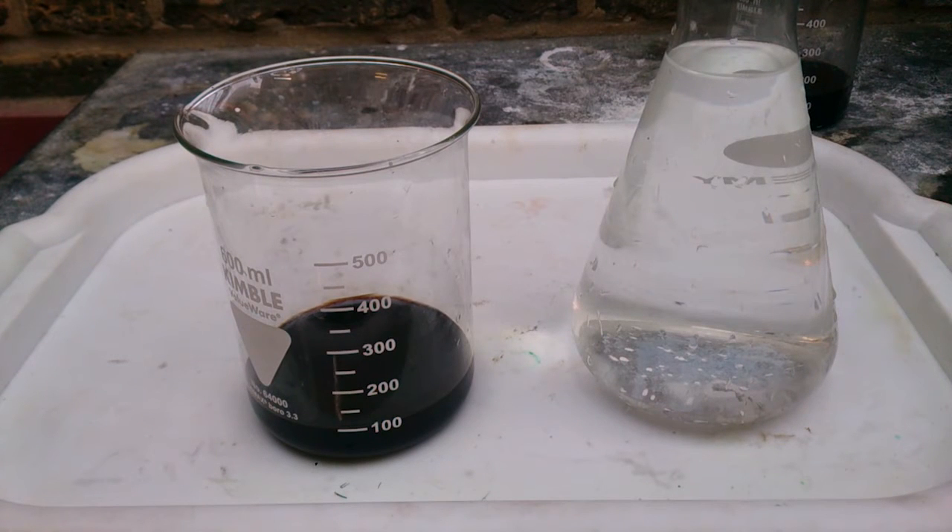Hi Gents! Today I will talk about one of the mistakes while precipitating gold. This kind of reaction may happen when you do something wrong, but it doesn't mean it will happen every time. To be more specific, I want to talk about copper chlorides.